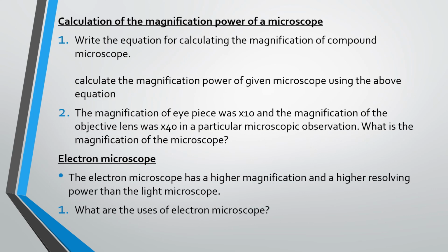And here also you have the questions that you have to answer under the topics of calculation of magnification power of the microscope and about the electron microscope. So you have to answer these questions in order to make your own note.